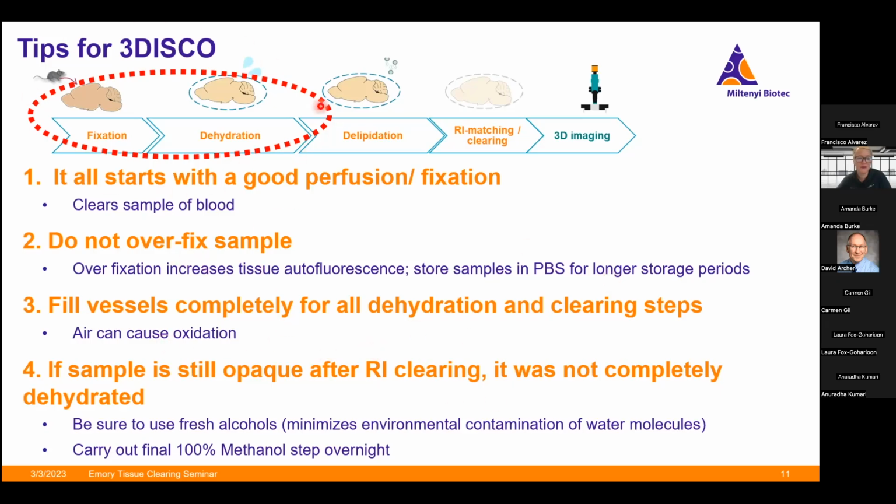When you're going through this process of fixation, dehydration, all of these steps really, fill the vessels completely. You don't want to leave any air. This can cause oxidation to your sample, and then you'll start noticing that the transparency is not as nice.